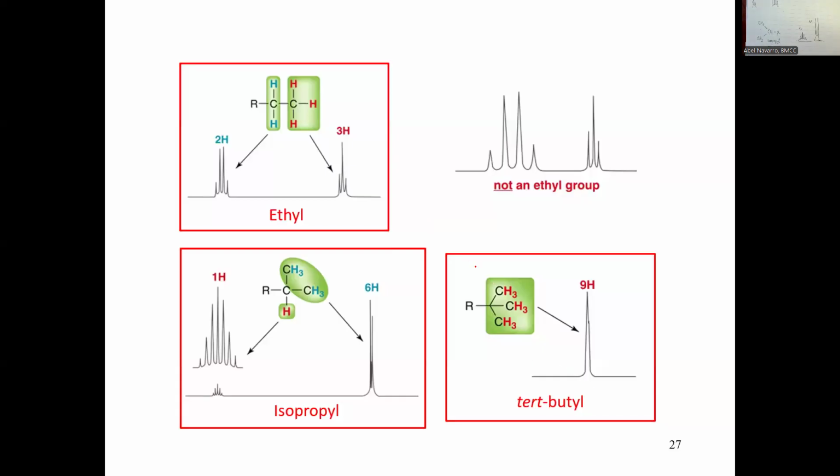And the last one, that's a conventional, very typical peak that you will see in NMR, known as tert-butyl. Tert-butyl groups don't have neighbors because this carbon right here has no hydrogens. So this CH3 is a singlet, singlet, singlet. All 3 are singlets. It's 3, 3, 3, 9 hydrogens. So you see a very tall peak on the right side. Not as far right as the TMS, the standard, but it will be on the right side as a tall singlet, 9 hydrogens.